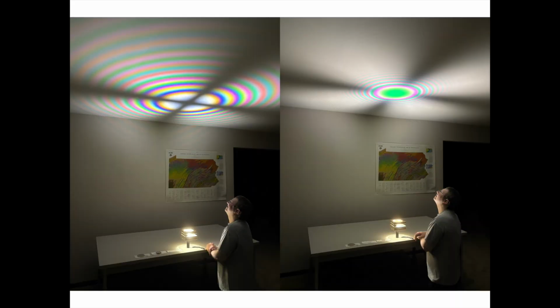So our quartz generates a fairly unique optic axis interference figure due to its optical activity. Going back to our experiment, you can see that optic axis interference figure here as well. The color of that central circle is going to be based on the thickness of our quartz crystal.